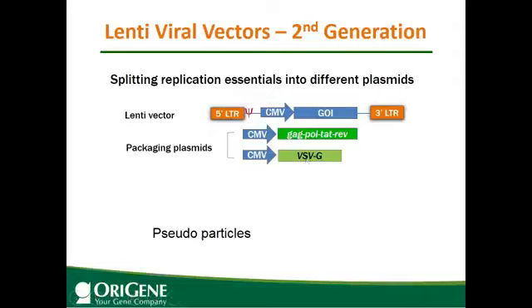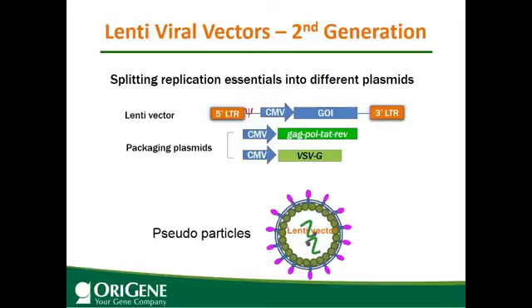So that's why the particles are called pseudoparticles. They are not the wild-type particle. They don't have any viral gene in them. So they only contain the lentivector, carrying your gene of interest to be delivered into your cells.